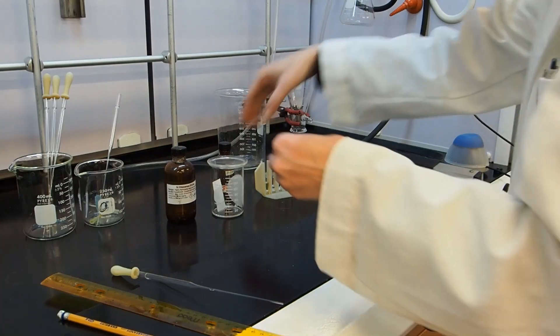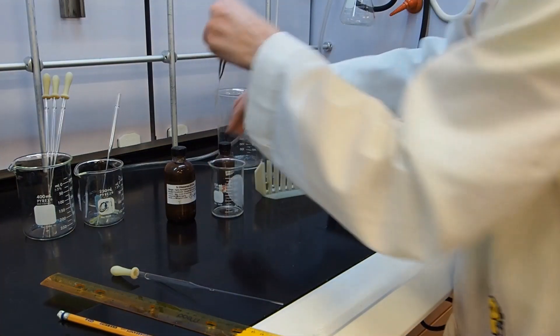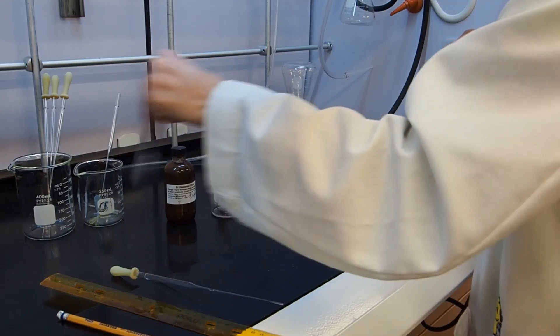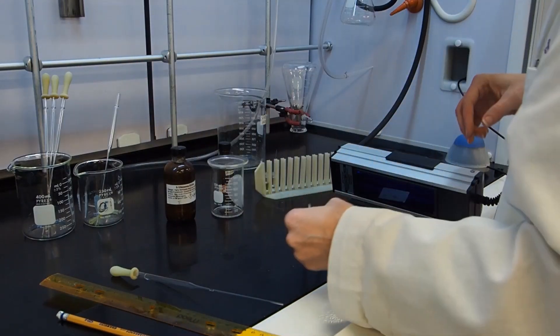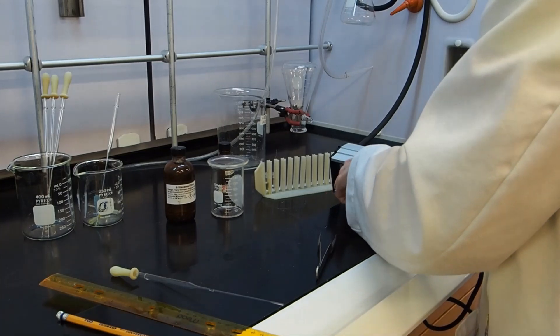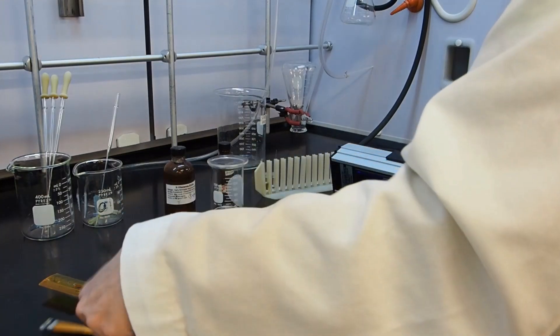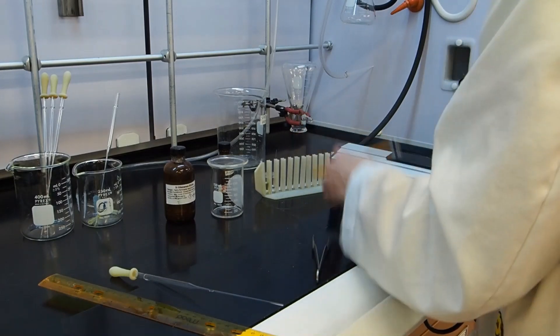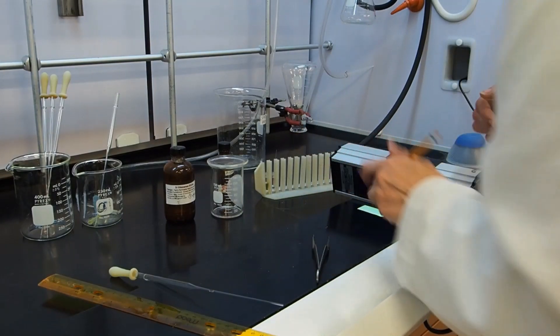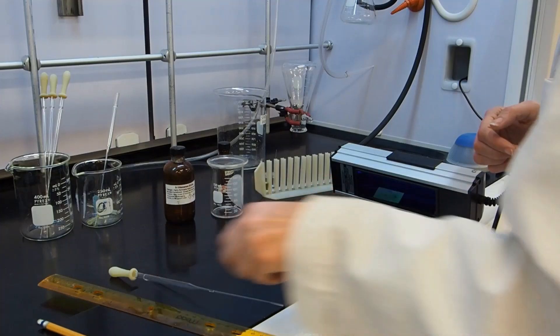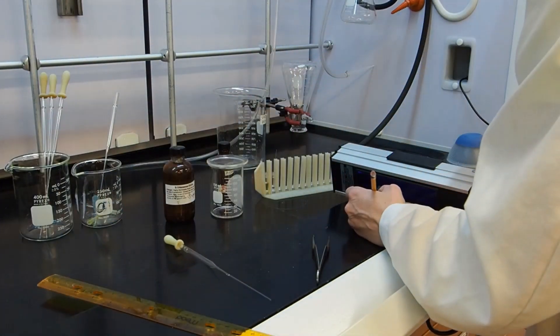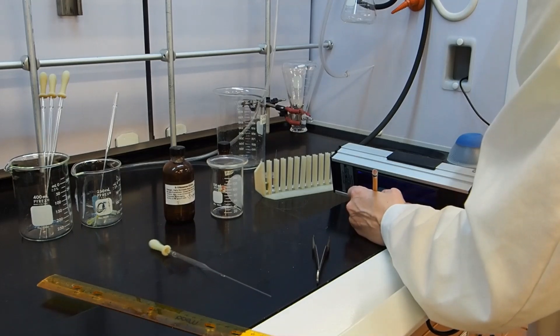The TLC has finished running, so I'm going to retrieve it from the chamber and let it dry. I'll draw a line where the solvent was. Then I'm going to look at it under the UV lamp and circle my spots. I can see there's a very low spot for the p-cresol.